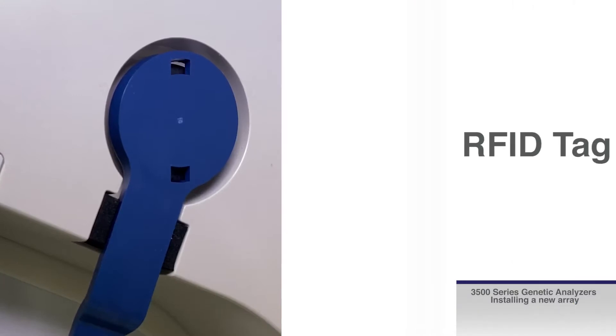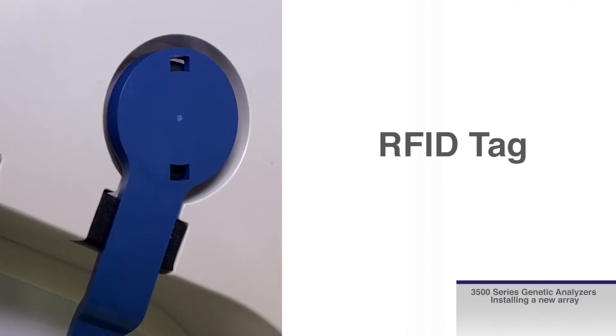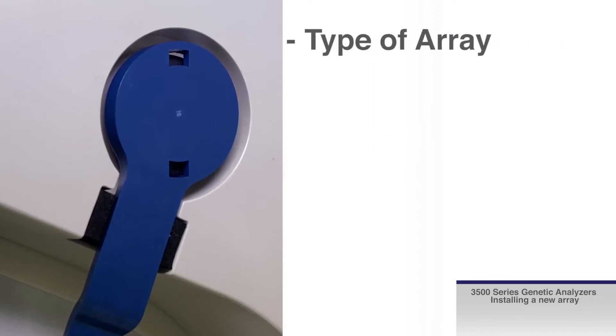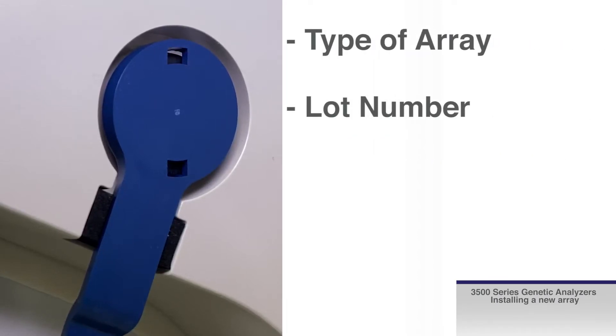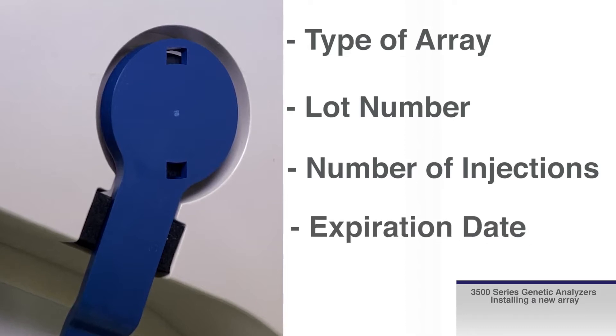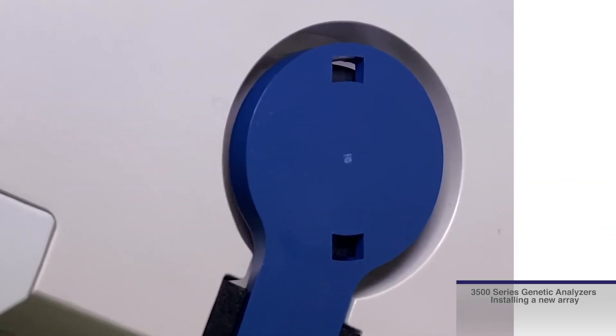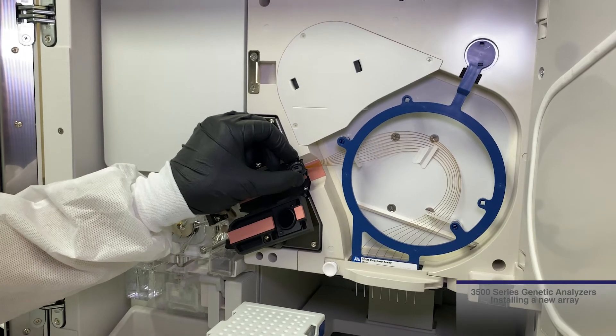One thing to note: the array carries an RFID tag, as with all of the consumables, allowing the software to record the type of array, lot number, number of injections, and expiration date. The RFID tag is located inside the circular portion of the array housing. The RFID rests in this opening.